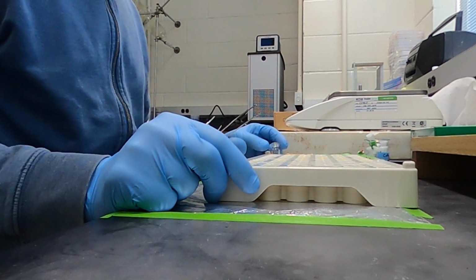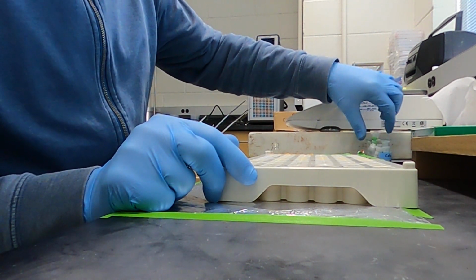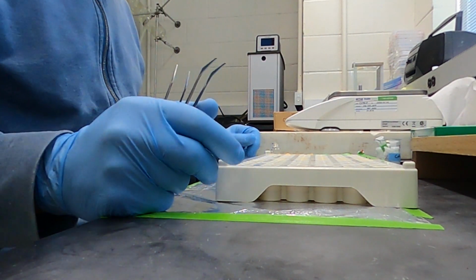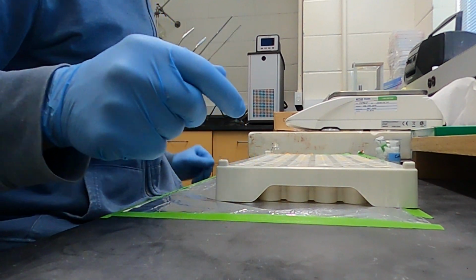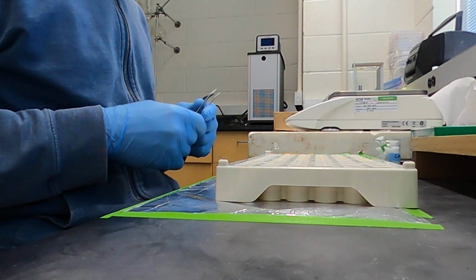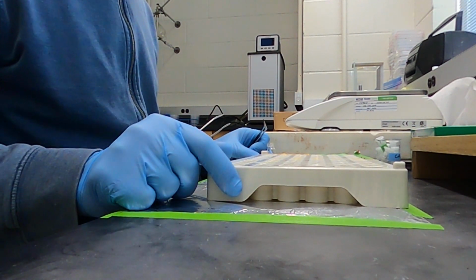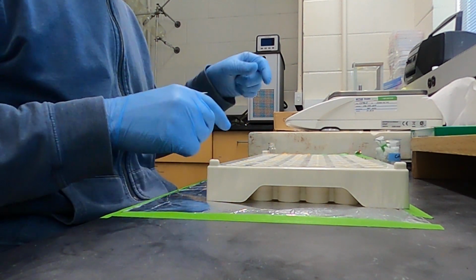And these standards in that case will be NBS 19, NBS 18, and a home standard is called TASOS, which this TASOS is used in that case just to see how the quality of the measurements, just to see if it's stable, just to see if we obtain the values that are expected.